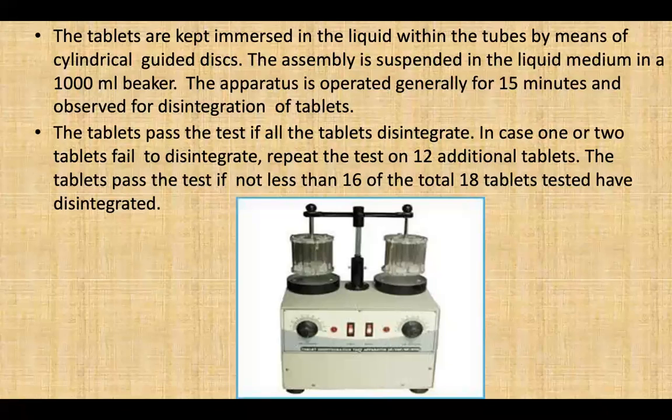The apparatus is operated generally for 15 minutes and observed for disintegration of the tablets. The tablets pass the test if all the tablets disintegrate. In case one or two tablets fail to disintegrate, repeat the test on 12 additional tablets. The tablets pass the test if not less than 16 of the total 18 tablets tested disintegrate.